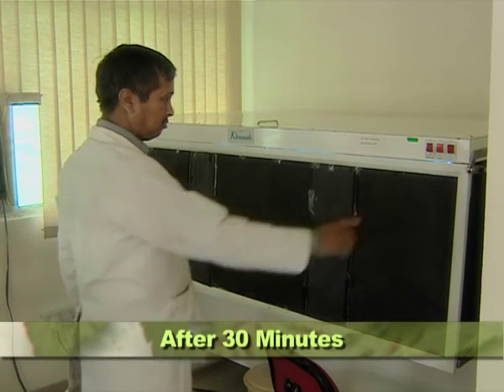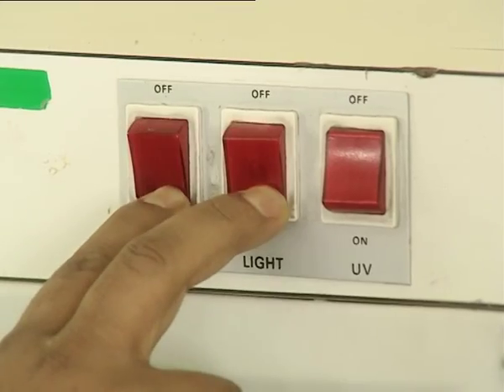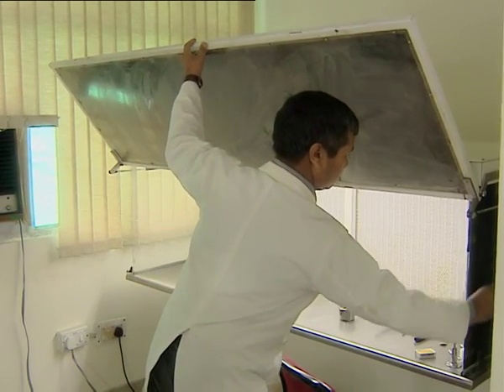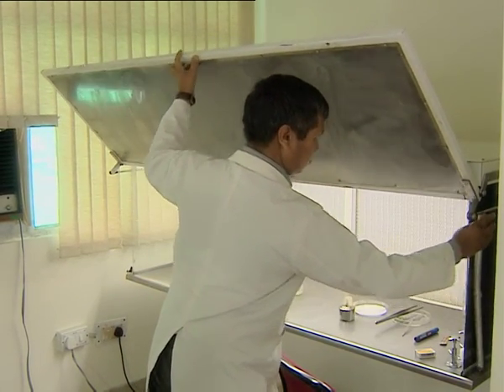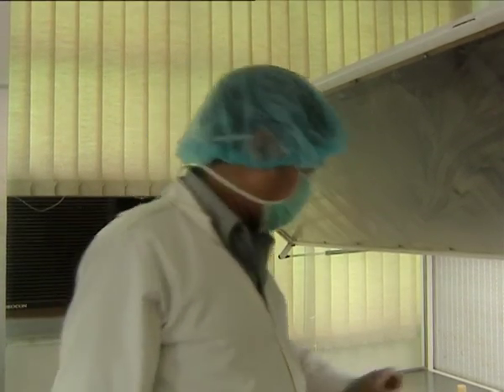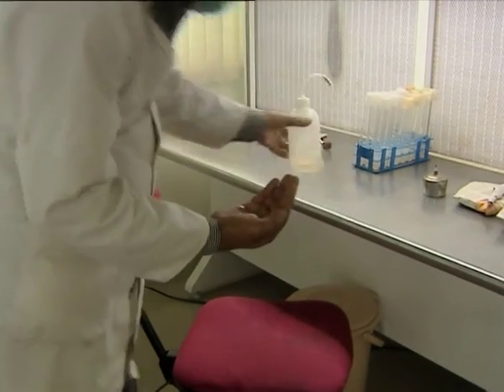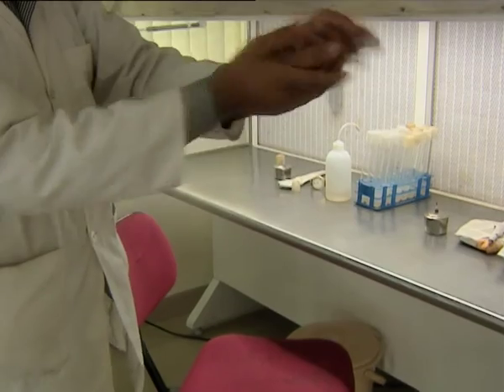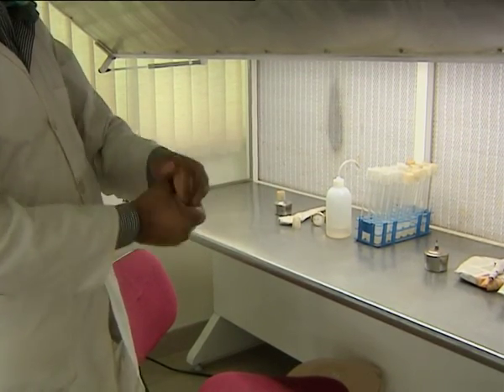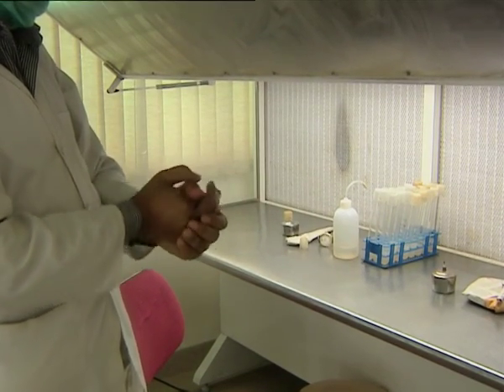After 30 minutes, switch off the UV light, switch on the chamber lights, open the shutter, and then switch on the airflow. Prior to operating the laminar hood, it is essential to wear a clean and sterile face mask and a cap. The panel of the laminar that faces us has a high-efficiency particulate air filter.